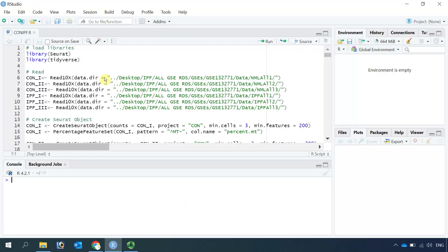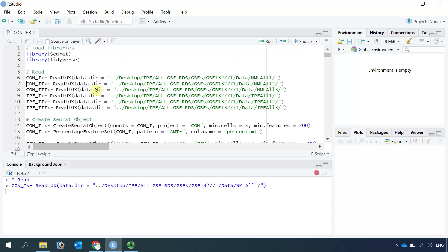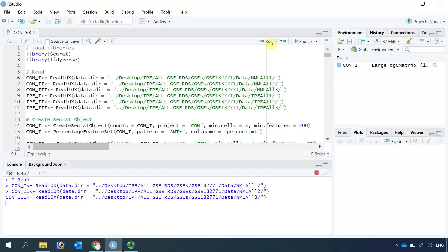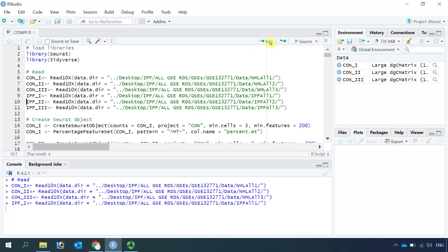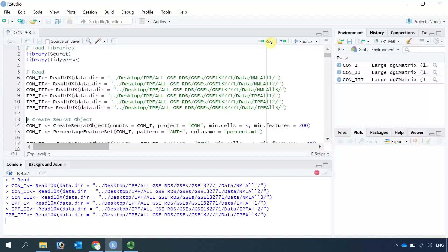Now we can read the data into R using the Read10X function. Let's read the healthy human lung single-cell RNA sequencing data as ctrl1, ctrl2, and ctrl3. We read the fibrotic lung single-cell RNA sequencing data as ipf1, ipf2, and ipf3.